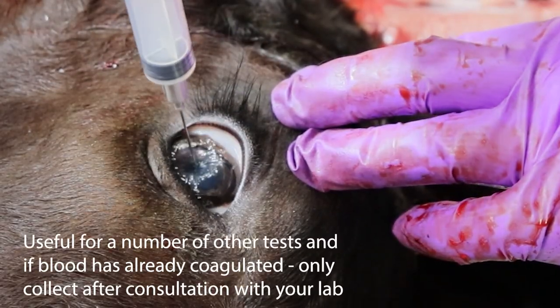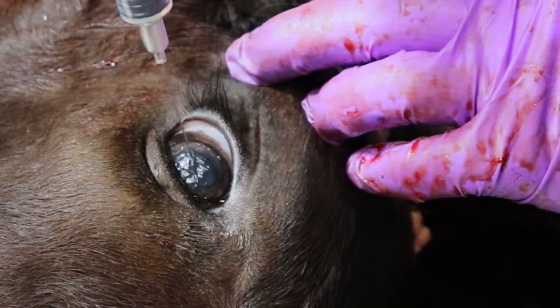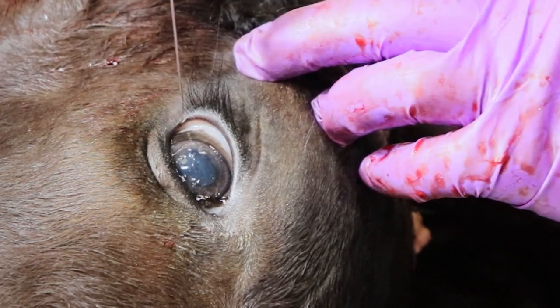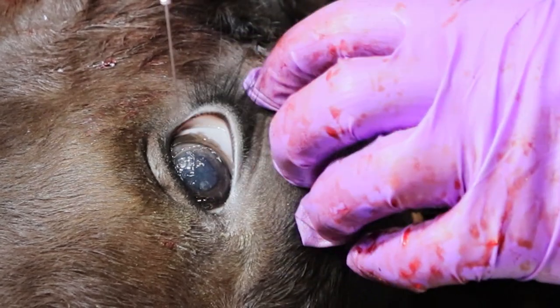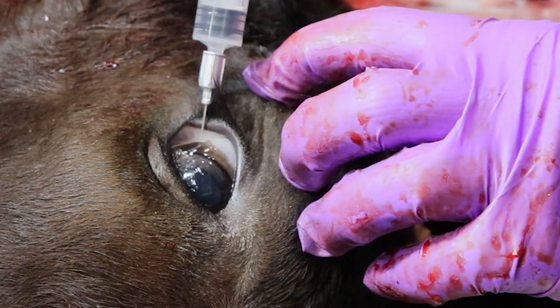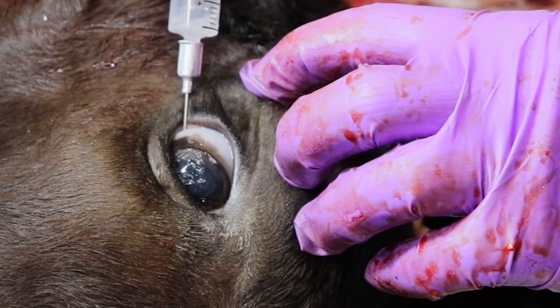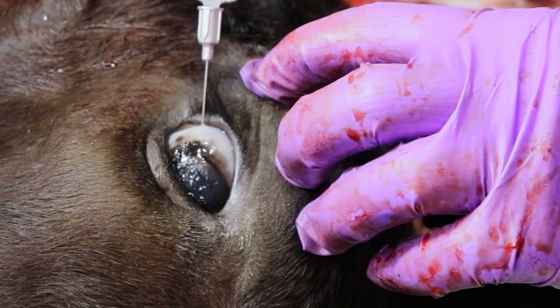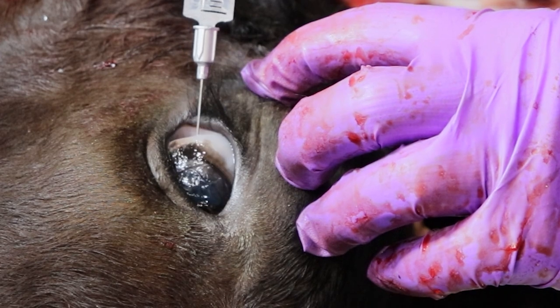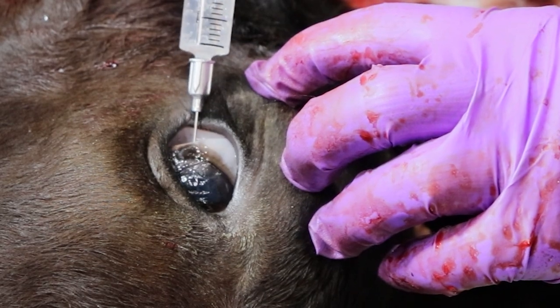For vitreous, you need to stab into the back portion of the eye. If you go directly down the center you will hit the lens and won't be able to penetrate. So if you go in through the sclera, which is the white part of the eye, you can poke into the back of the eye to withdraw a very thick or viscous fluid, which is your vitreous. The vitreous is viscous; the aqueous, which is in the front of the eye, is more watery.